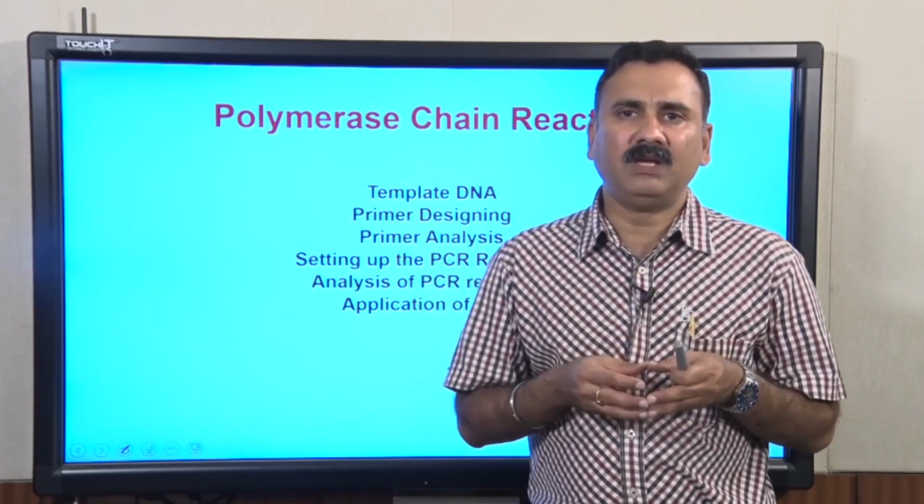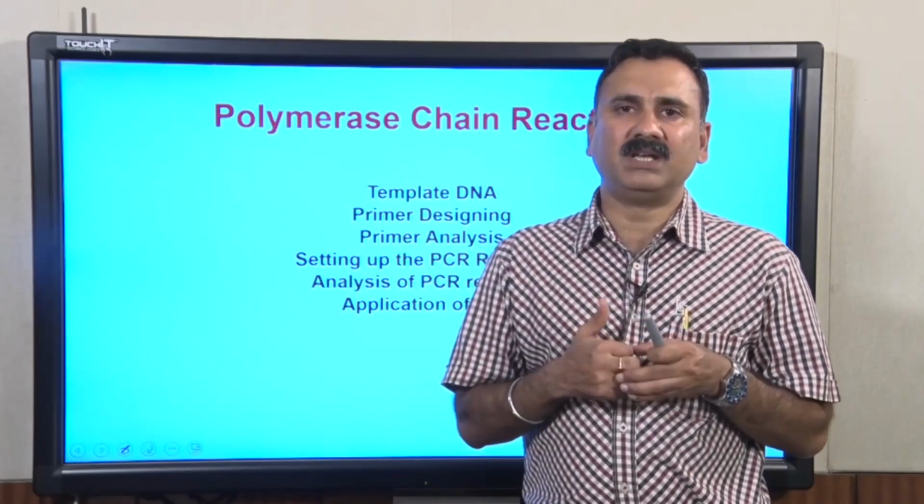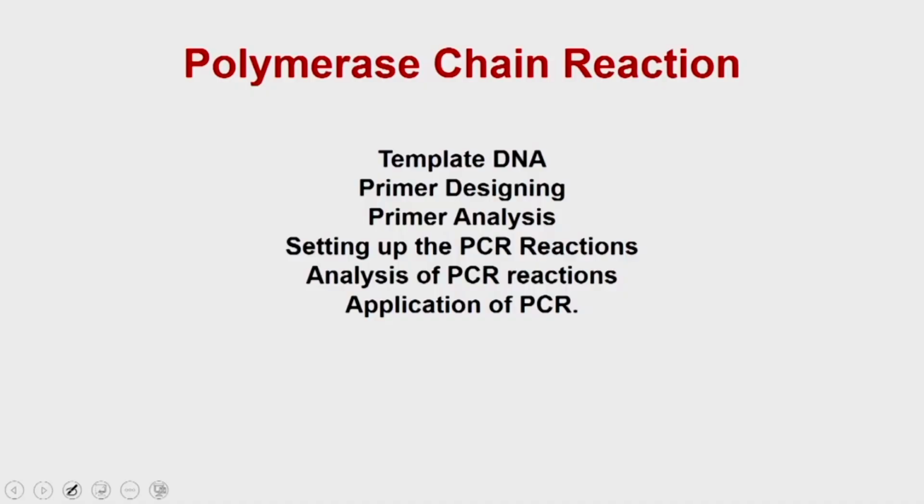In today's lecture we are going to discuss the technical aspects of the polymerase chain reactions, and the reagents which are important for it, such as the template DNA. Then we will discuss primer designing in an interactive way, so that you will be able to design primers using the available softwares. We will also show you with the help of one of the softwares how to do the analysis part.